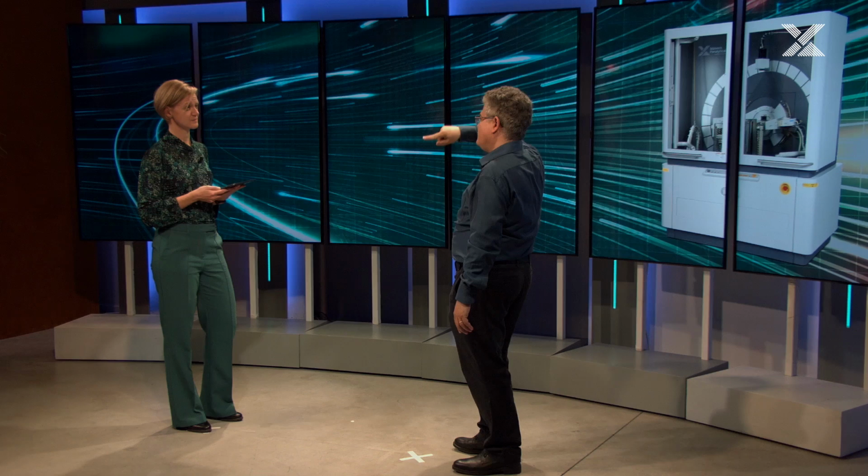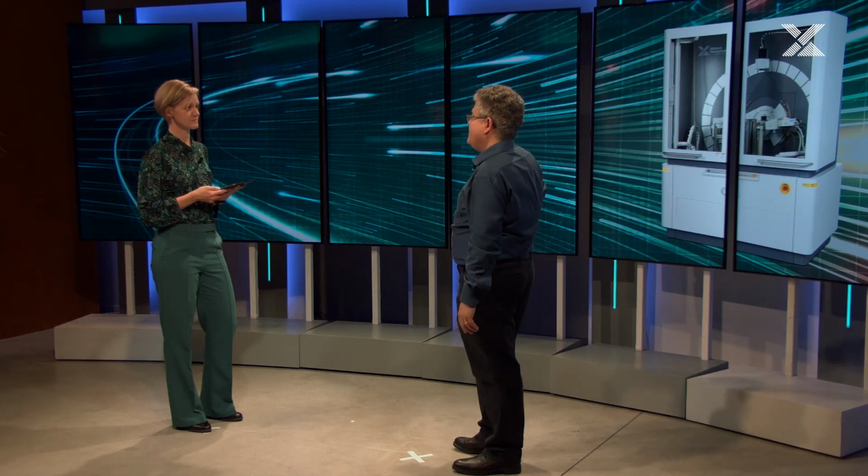So imagine you have a square lattice of atoms, and when you go a certain distance and probe, how many atoms do I find at that distance? Maybe 4, maybe 6, depending on the kind of lattice. When you go further, to your next round, each of these gives a peak, and that is what we call a pair distribution function, and that gives me information about the molecular fingerprint.